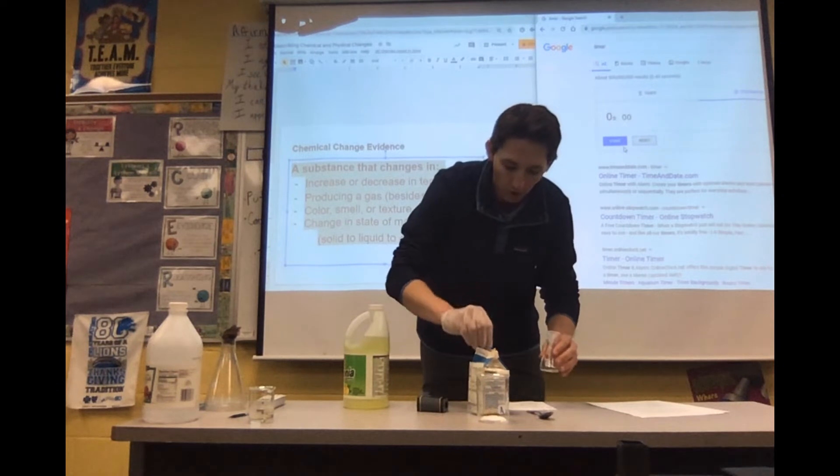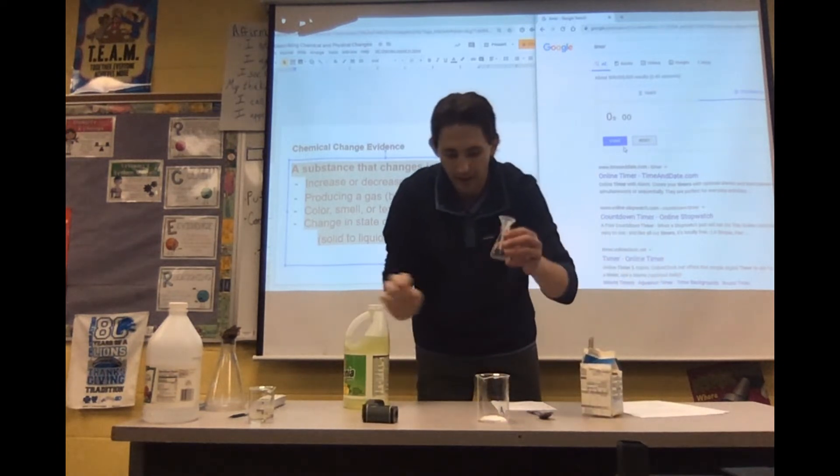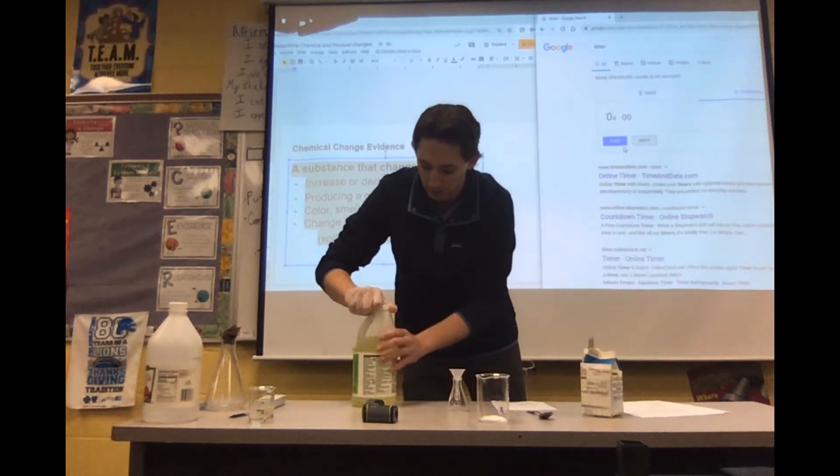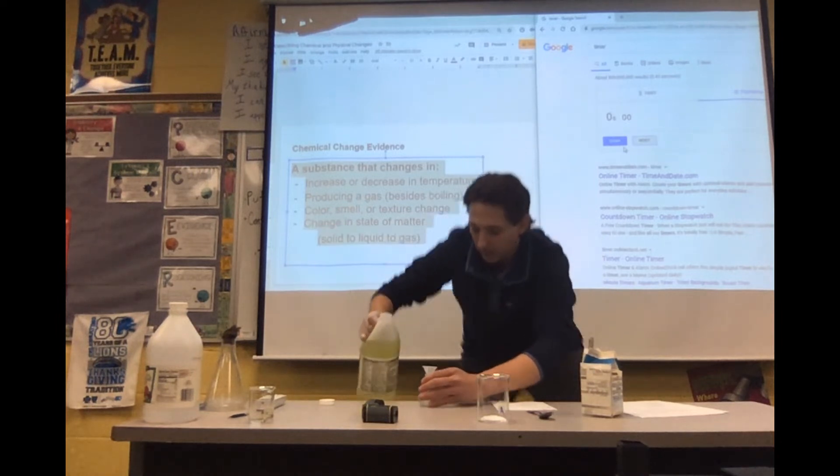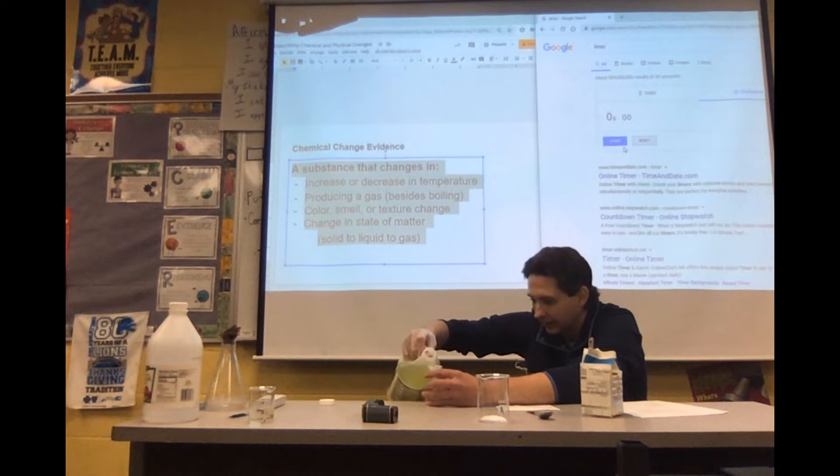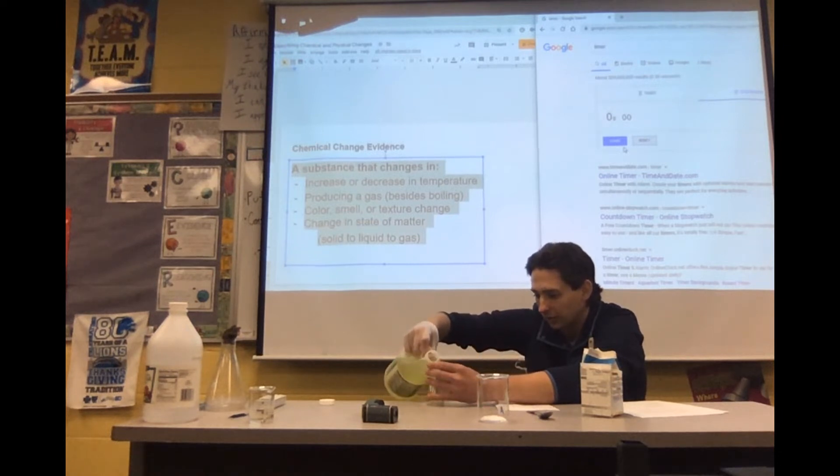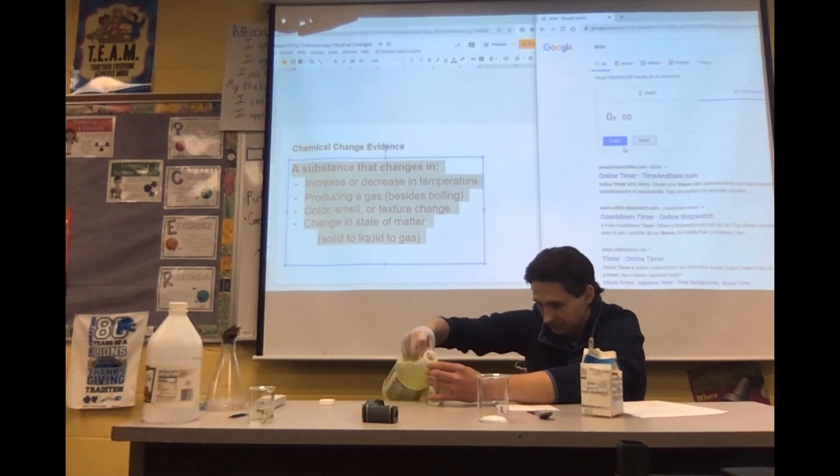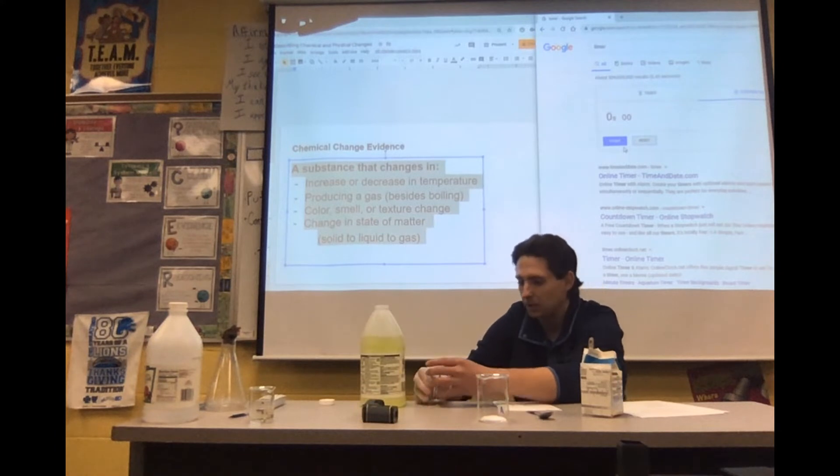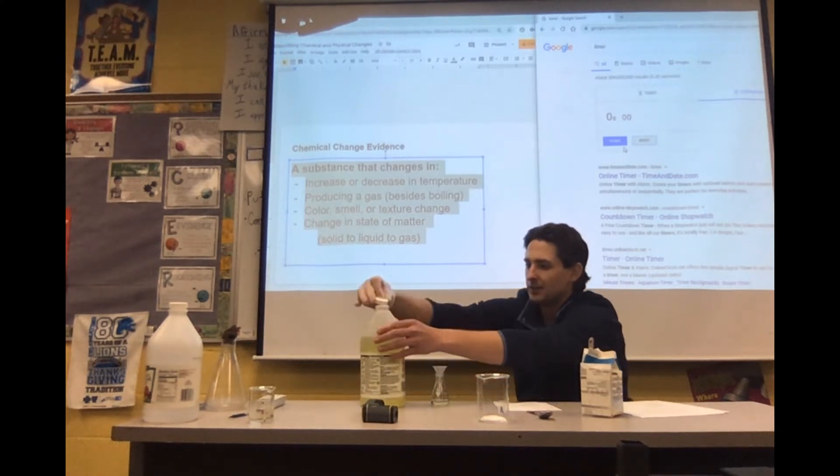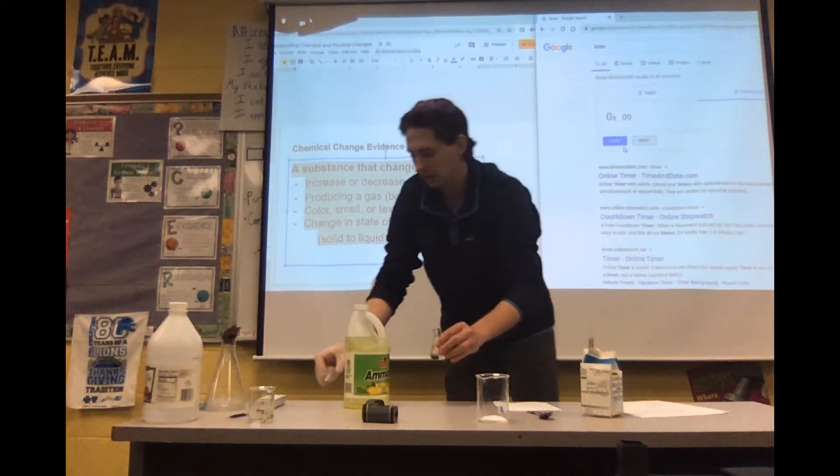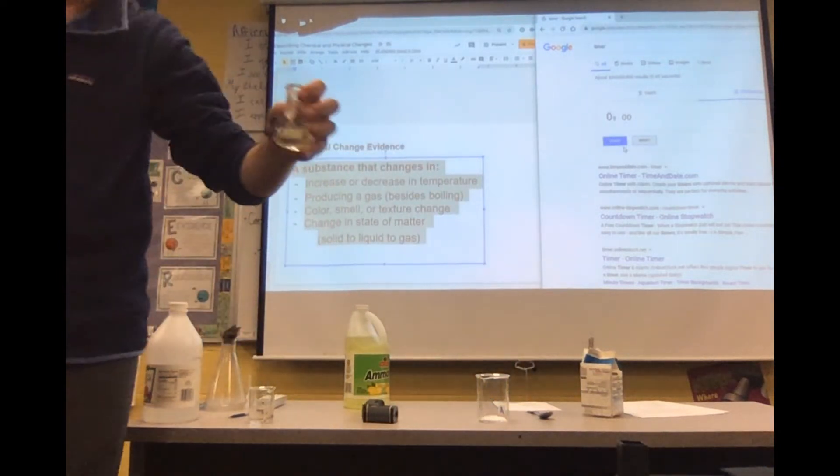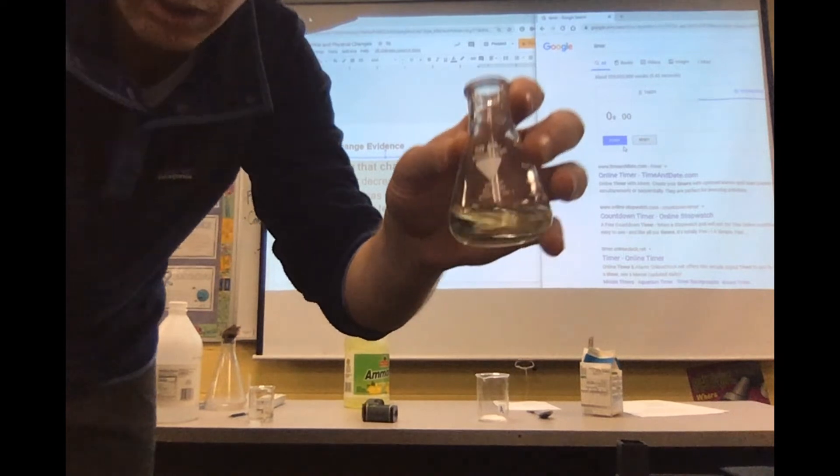15 milliliters of ammonia. So I am going to just add 15 milliliters into my miniature Erlenmeyer flask. Notice how I am away from the epsom salt. I definitely do not want to smell that, it will give me a headache like it did last year. So here is about 15 milliliters of ammonia. Ammonia is used to clean household products, so no it is not deadly but it definitely gives you a headache.